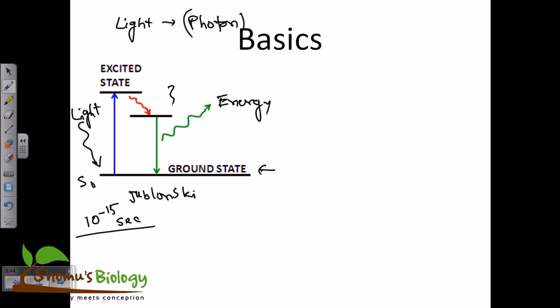For example, within the same energy level state, some amount of energy is released as heat, absorbed as heat, but some of it is released as fluorescence. So the energy released as fluorescence, the emission energy, is less compared to the excitation energy which we provide. Whatever energy we provide via a photon or light source is the excitation energy, which is high, so the wavelength is short. But after emission, the emission energy is low and the wavelength is high, so it releases a higher wavelength fluorescence, which we can measure, right?